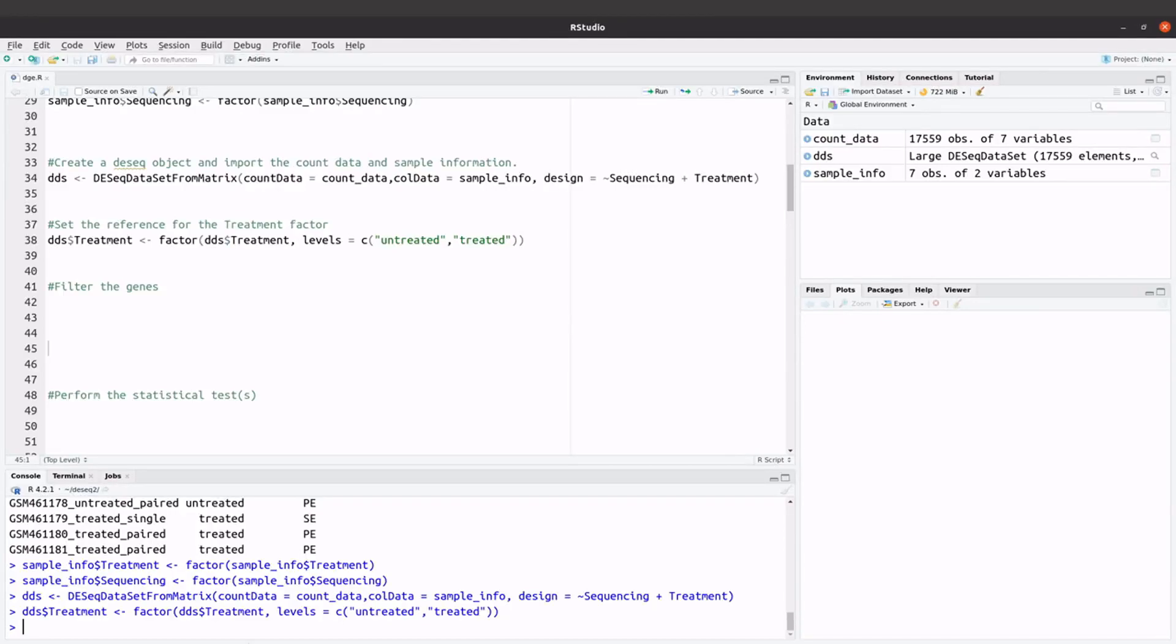We are now going to filter the genes. In the reality tutorial, I did not see any filtering step, but I thought I'd bring this up so that you also learn how to filter genes.